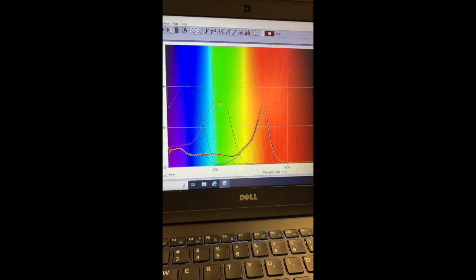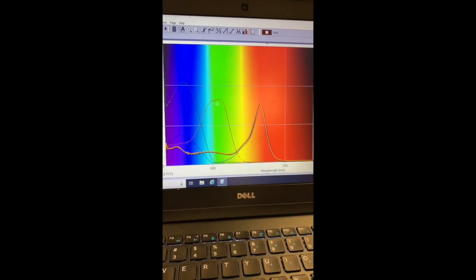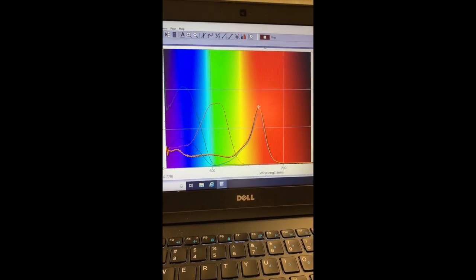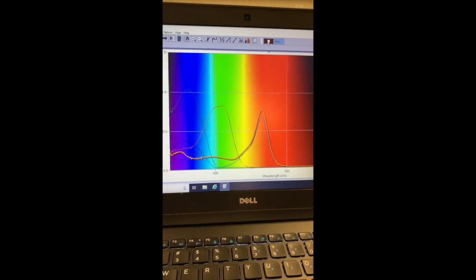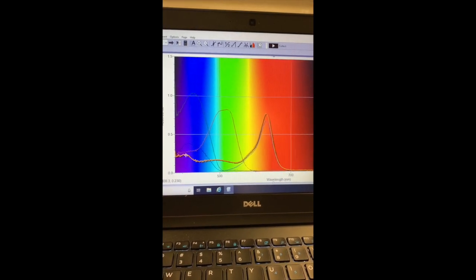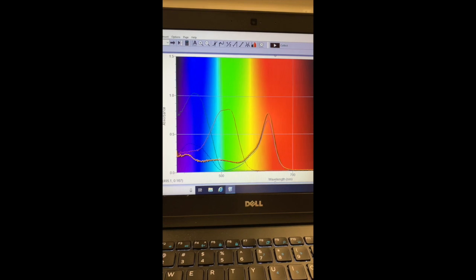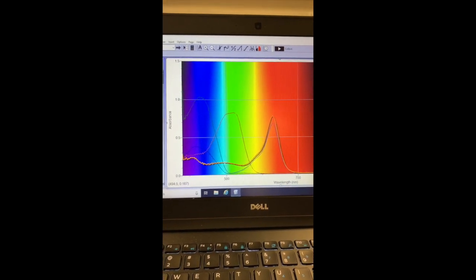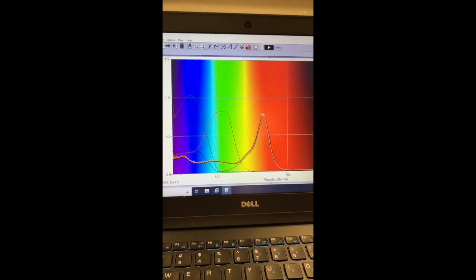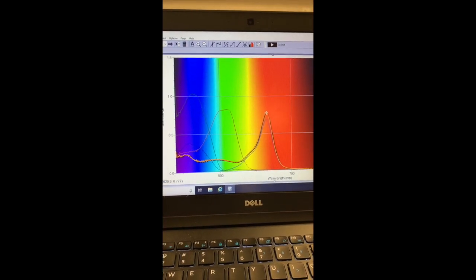And notice the blue is very interesting, very similar to green in a way. And if you know anything about art, that makes sense. We have a peak over here in about the same region, but we also have a peak over here, a little bit of a hump at 408.3, a little bit of a bump at 494.5, and then of course the largest peak is at 629.9 nanometers, and that was the green.